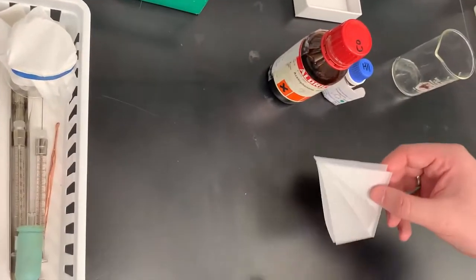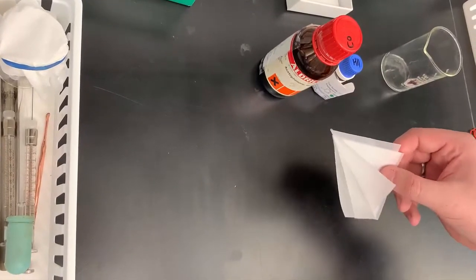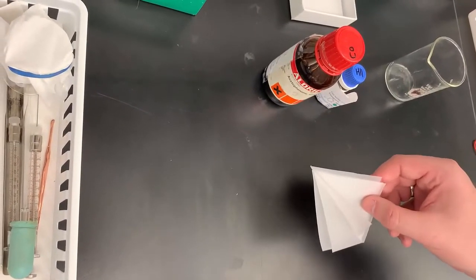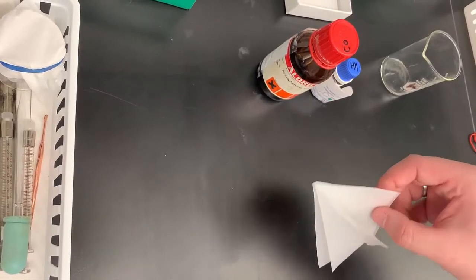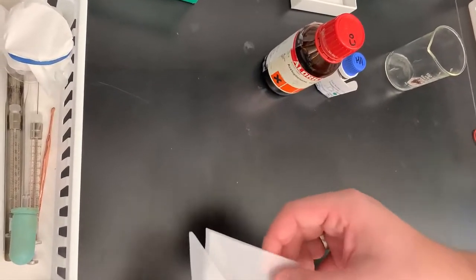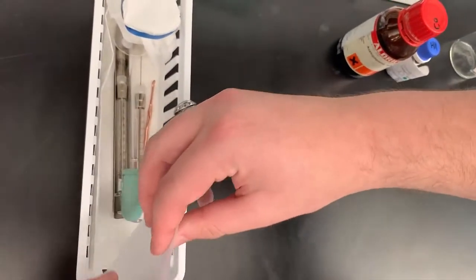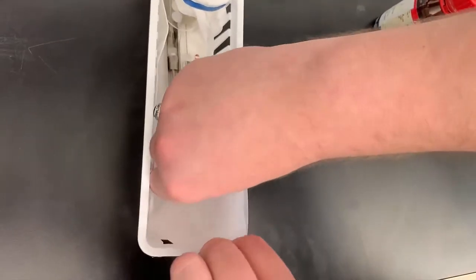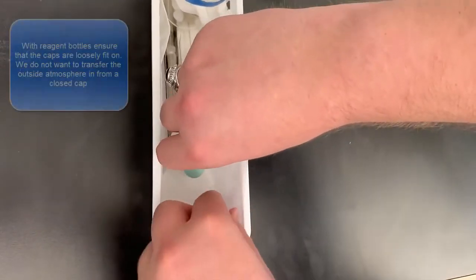Next, you'll want to put in any weigh paper you might need. You will need one for our solid base and then at least one extra for any solid reagents that you might have. It's good to tuck these under something heavy so they don't fly out when you evacuate the chamber.